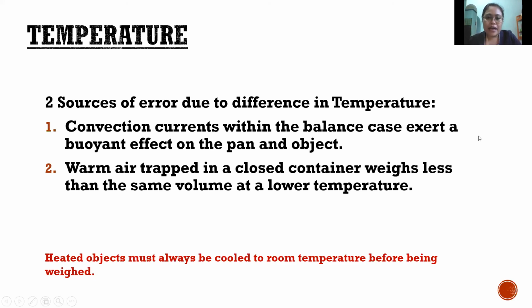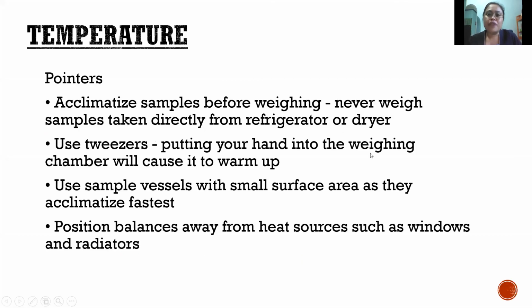That is why when your object is warm, its mass is lesser. When it is cold, its mass is higher. Therefore, our conclusion is that before weighing, the sample should be at room temperature. Whatever the temperature of the room or working area, the temperature of what we weigh should be the same. Heated objects must always be cooled to room temperature before being weighed. The same thing is true for objects from the refrigerator.